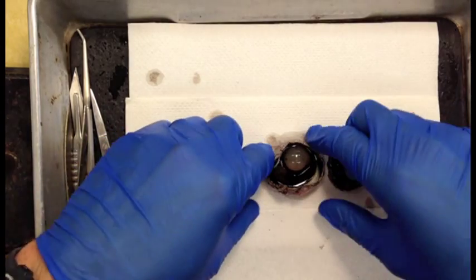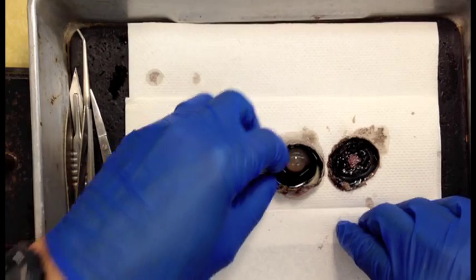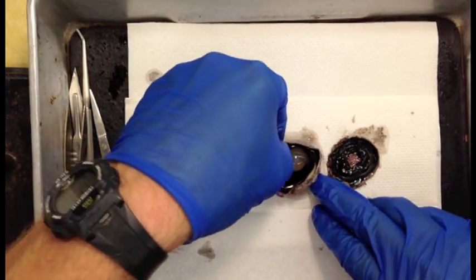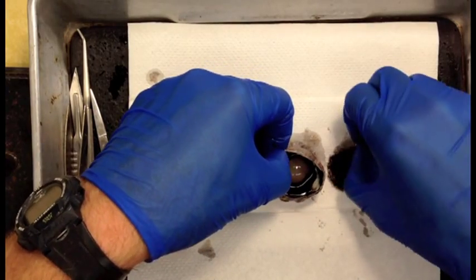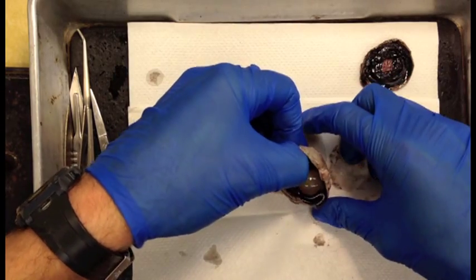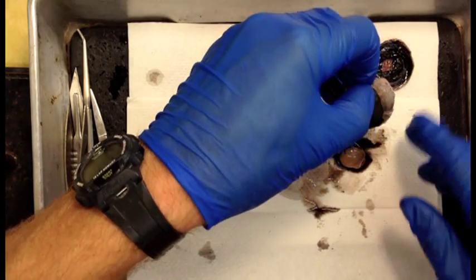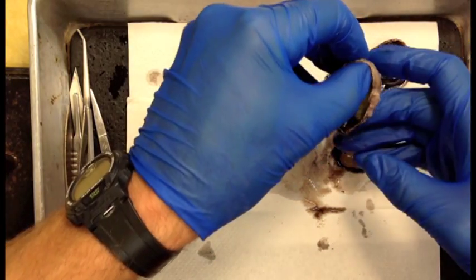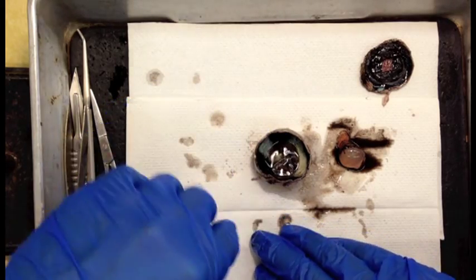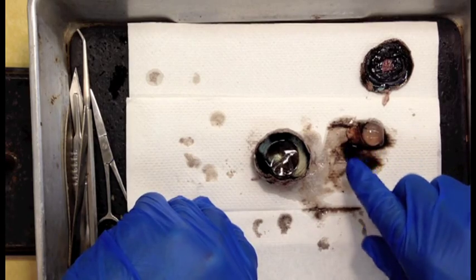Okay, so we look at the posterior portion of the eye, and right in the center, we can see the actual lens is floating in the vitreous humor. So I'm going to go ahead and pour that out. You want to be careful with the lens. If you put too much pressure on it, you'll actually crush the lens, and then you won't have much to look at. So you could see the lens here, and attached to it still is some of that vitreous humor.